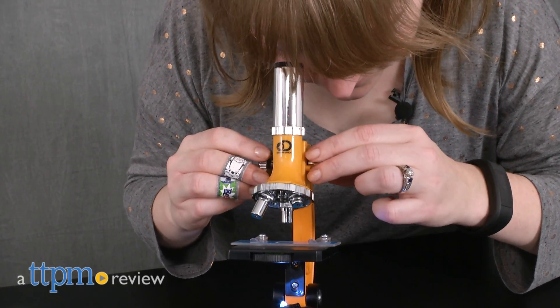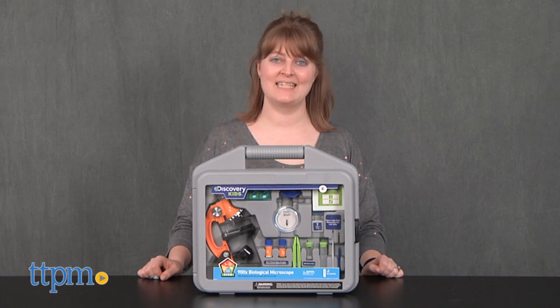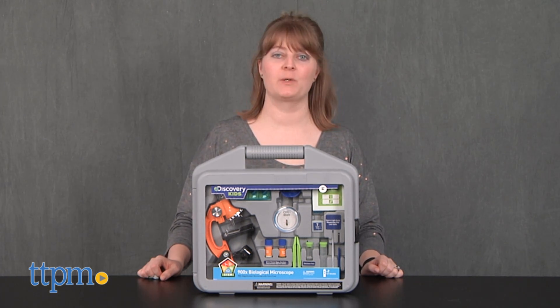Help kids explore the world around them. Hi, I'm Laurie from TTPM here with the Discovery Kids 900x Biological Microscope from Explore Scientific.